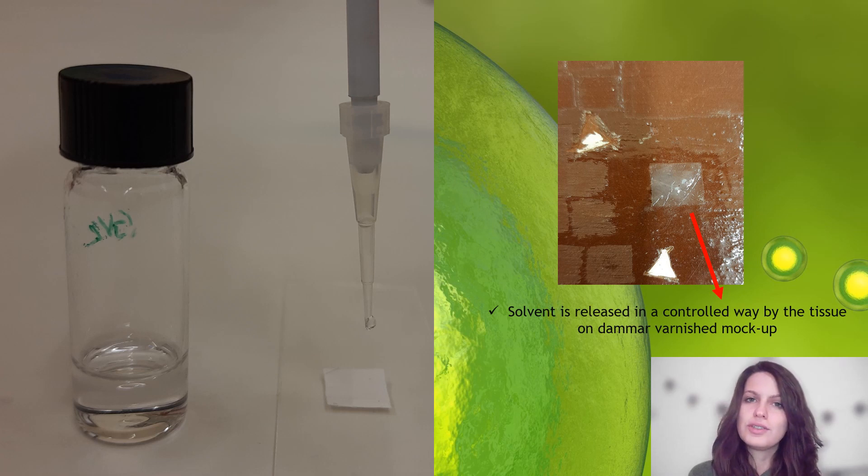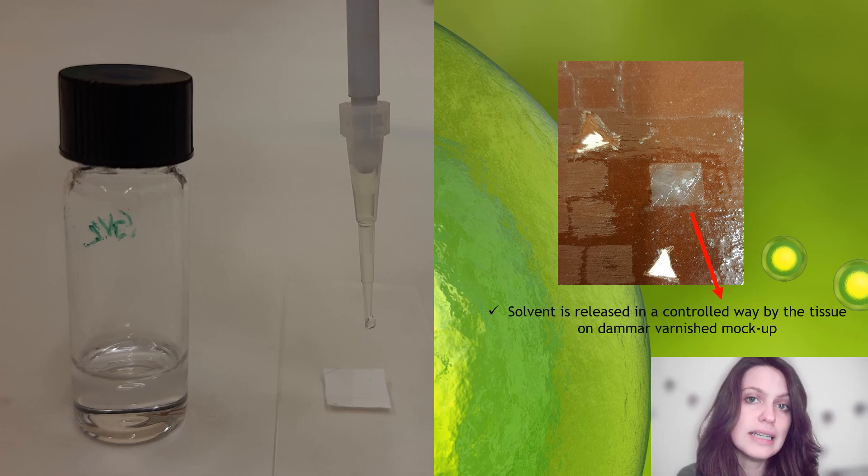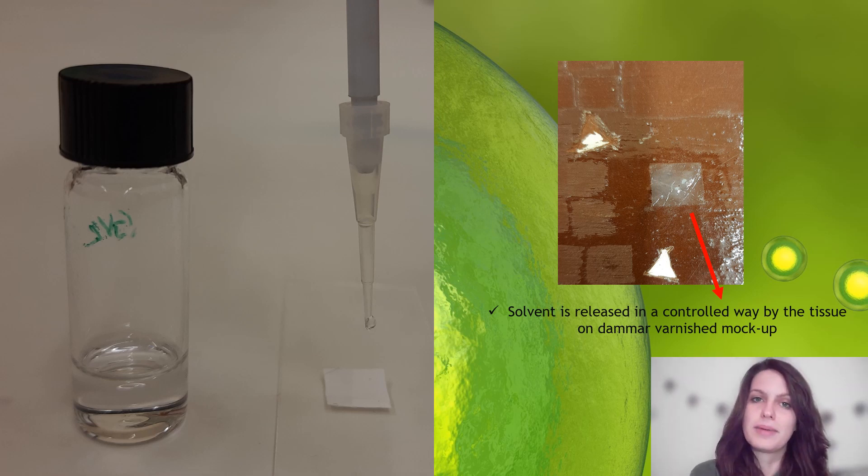After wetting the tissue with a green solvent, it is placed on a painting mock-up for cleaning purposes. In this way, solvent release is controlled by the tissues. After waiting some minutes, the tissue is removed from the painting mock-up and the cleaning is finished. After that, the efficiency of the cleaning is analyzed by micro-ATR-FTIR spectroscopy.